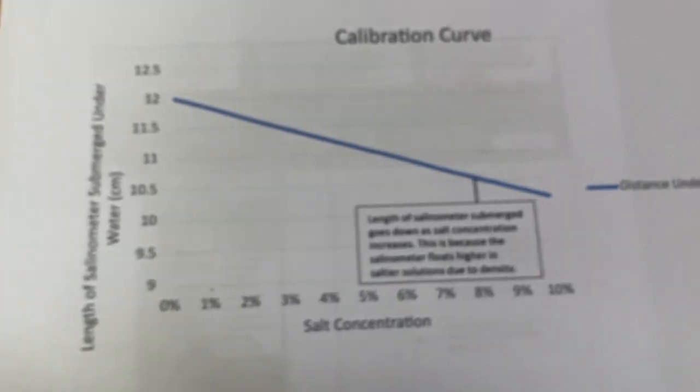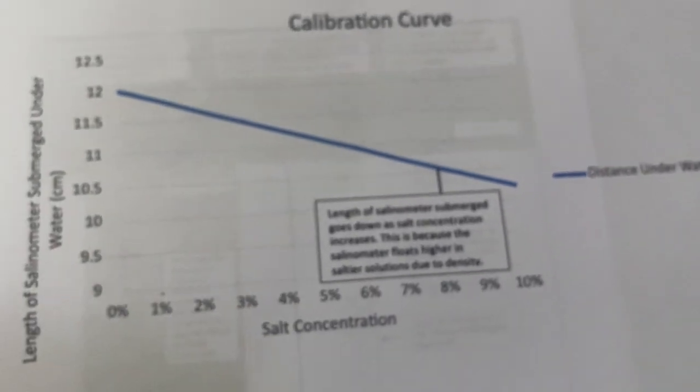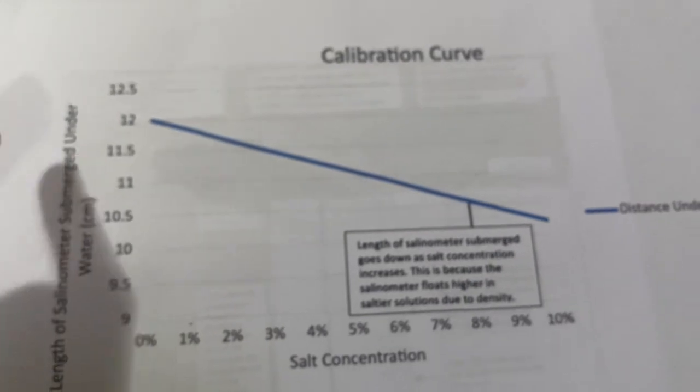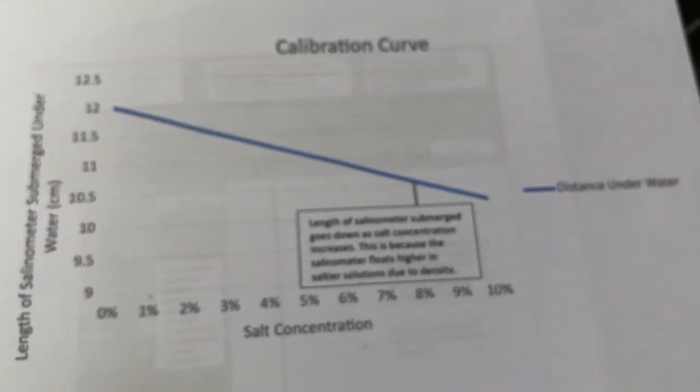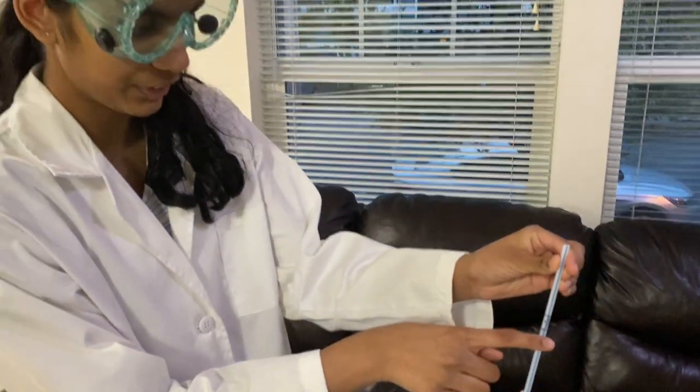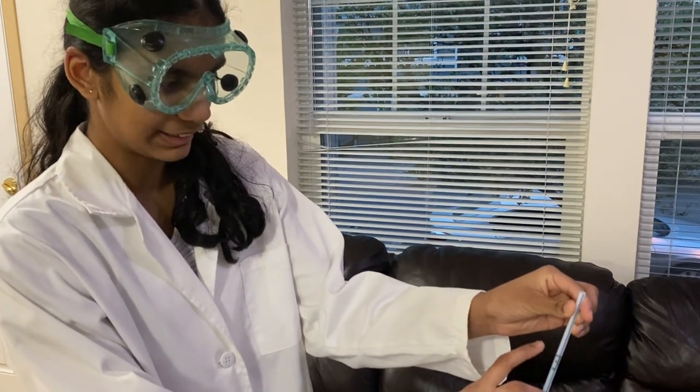Taking a look at my calibration curve: as salt concentration increases, the length of the salinometer submerged underwater decreases. This is because of the principle of density. We saw earlier that in my 0% salt solution, the water came all the way up to my 0% marking. In my 10% salt solution, it only came up to here. So the length is decreasing as the salinity increases.